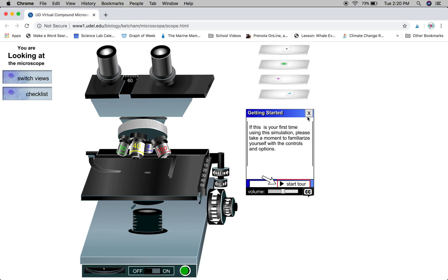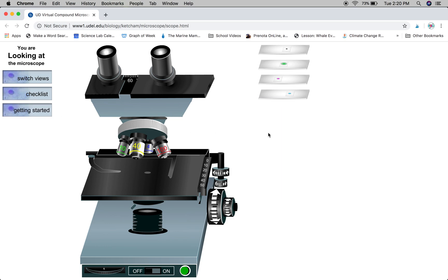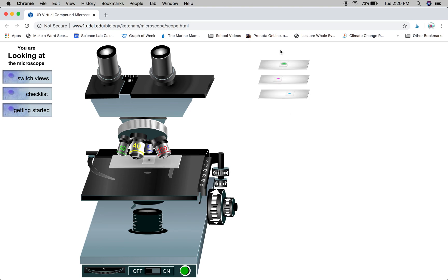If you've already done that, then it's time to start viewing the slides. Select one of the slides by clicking on it and it will move to the stage.